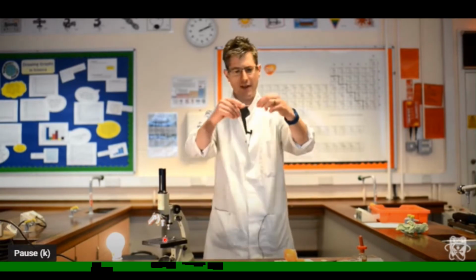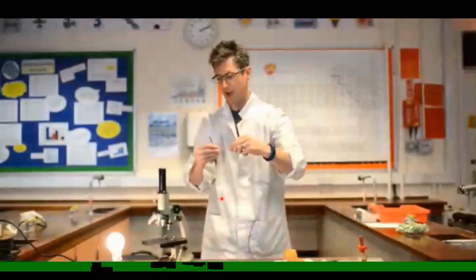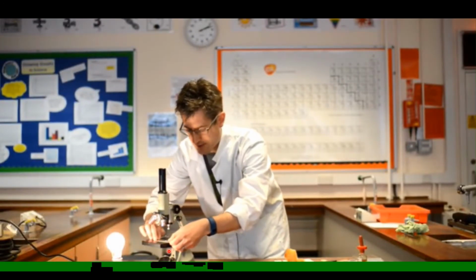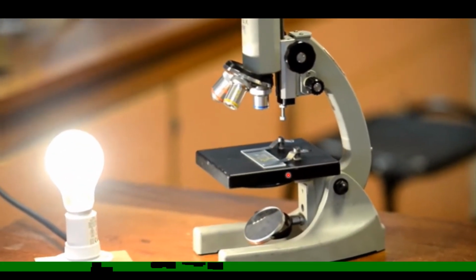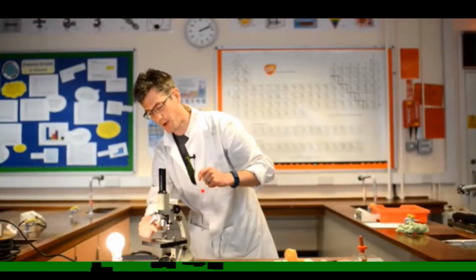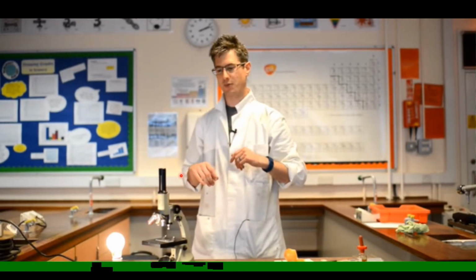So you have to use the low power in observing the specimen first, and you have to take the slide which is prepared, or you can use a permanent slide, and you have to keep that slide on the stage and fix it onto the stage by using the stage clips. Then you have to keep your eye on the eyepiece, and it is a must to keep both eyes open when you are observing through a microscope.